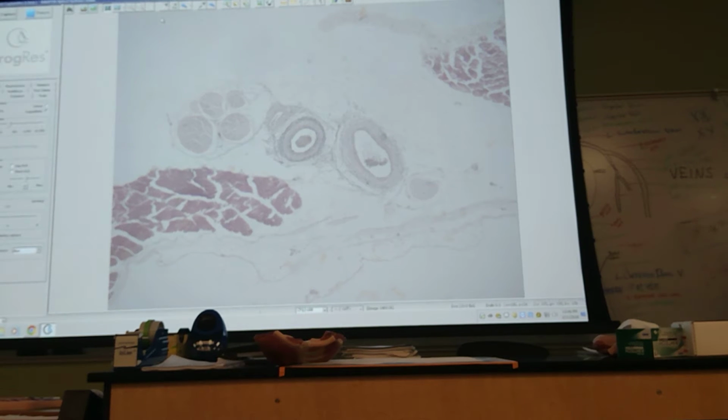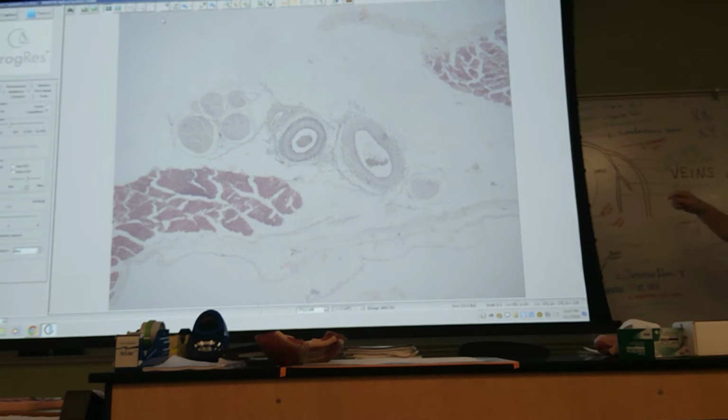But in 212, we also looked at this. Right there. That's the yellow tube. On Baldy, that's a nerve. And again, we're not going to go back there and enjoy the finer points of a nerve. What we're interested in today are the other 2 tubes, the red and gray, which are artery and vein. And that's these 2. Basically, there's another vein right there, the smaller one. Okay? So, we're going to focus on these.